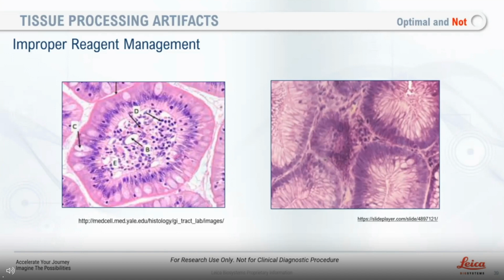I think long term, as you move down and begin to use it, not only would it not process properly, but at sectioning, I think it would make it difficult also. All right. Thank you. Next question.